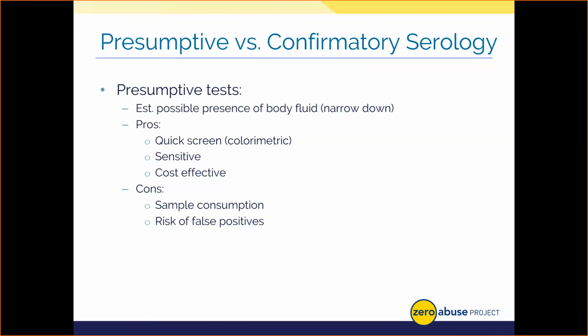For example, many different items, such as vegetable enzymes, have been demonstrated through research to potentially scramble a presumptive blood test, leading to a positive result when a body fluid actually isn't present. Because of false positives and negatives in our presumptive testing, we cannot definitively say a given stain is a particular body fluid at this point, and we need to confirm the stain in a second round of serology-based testing.